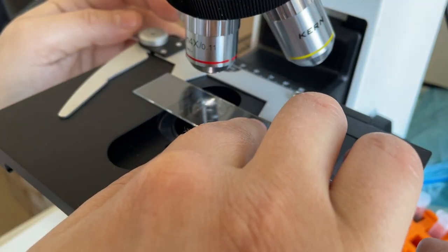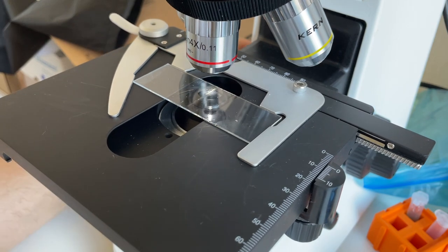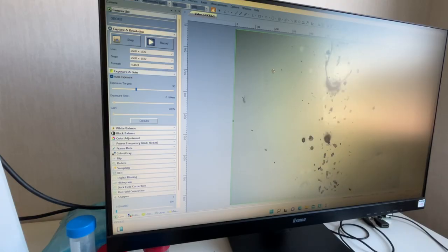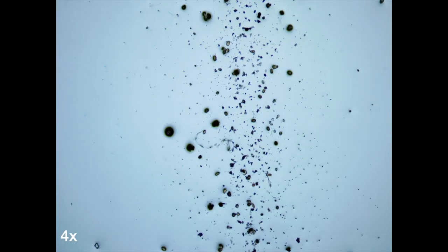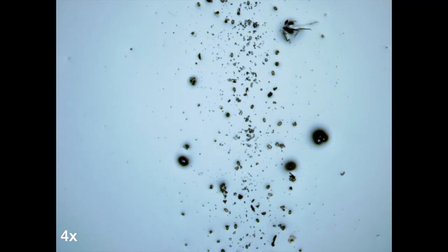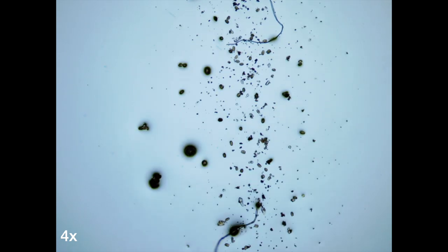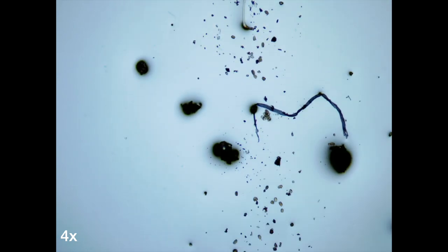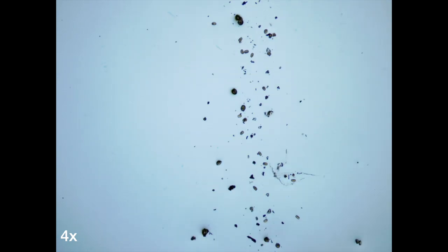Now, let's put it under the microscope and let's see what happens there. And as you can see, we've got plenty of particles from air just by biking around. I will leave the video here. It's between bright field and dark field, between 4 times and 40 times. Most of them are pollen, which I have no idea from which plant.